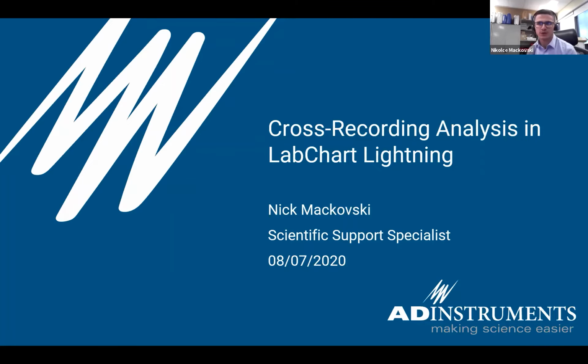Okay, so what we have here is one of my Lightning files. To get the most out of the table, I'm doing a mock experiment using our human non-invasive blood pressure device sold by ADInstruments. People just put it on their wrist, and we have a little cuff that's placed over two fingers, and you're able to measure multiple things here. You can measure your systolic and diastolic pressure, which can then calculate your mean arterial pressure. You can also calculate your heart rate, and of course the finger pressure as well.